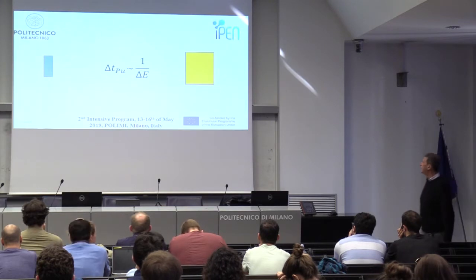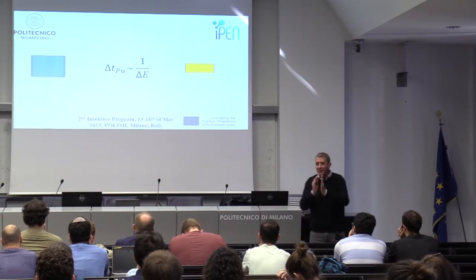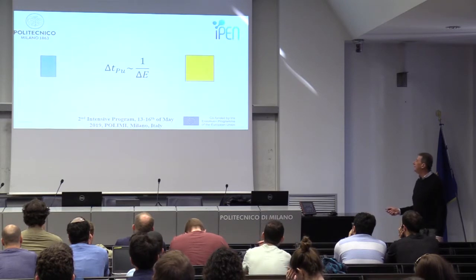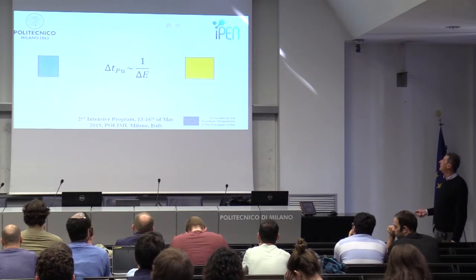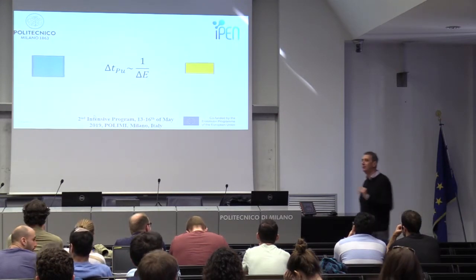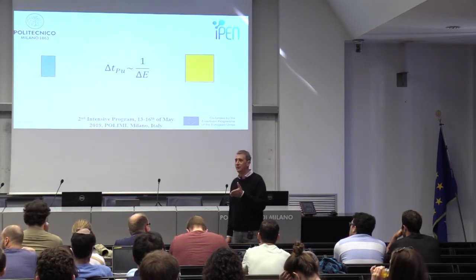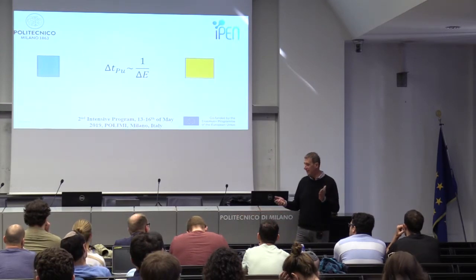Now, I don't want to go into the detail here, but I want to show you this as a last comment. It's a very special animation that I did for you. It's very complex. So one becomes narrow, the other becomes large. You see the time. If the pulse becomes very short, the energy of the pulse is less and less defined, more and more broad. So that means that if you want to study a phenomenon on a 10 femtosecond time scale, you do not have the spectral resolution because the pulse is very broad. So you have to choose what you want to do. All right, that's an interesting thing.